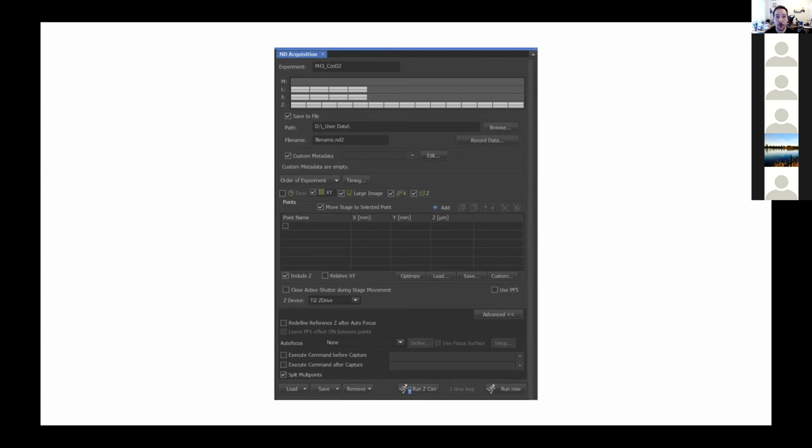And you may also want more control. So maybe you're trying to find rare events in a tissue section. So maybe you need to look at the tissue section and then find where these rare events are. And you want to do that without having to be at the microscope. So you could set something up where you first detect the tissue section, then run another step where you find these cells or the injection site or the expression site, and then go into higher magnification and capture those regions. And all of that can happen autonomously. And the other thing is you may just want to perform the analysis at the same time, so that when you leave the microscope, you have the results in hand.